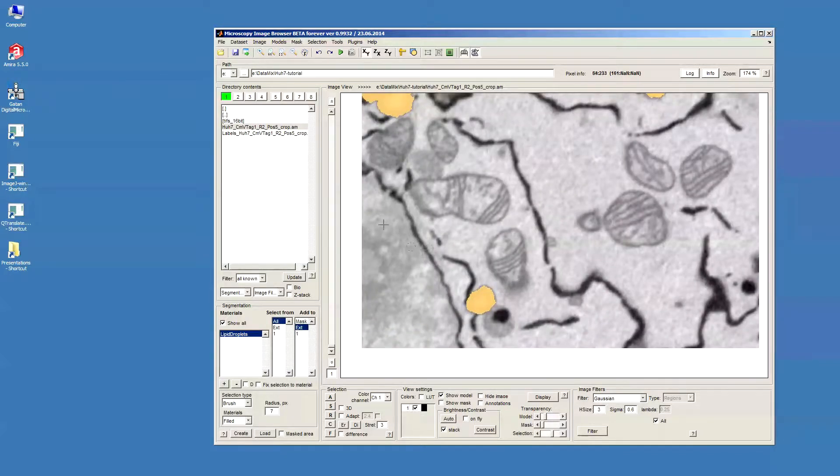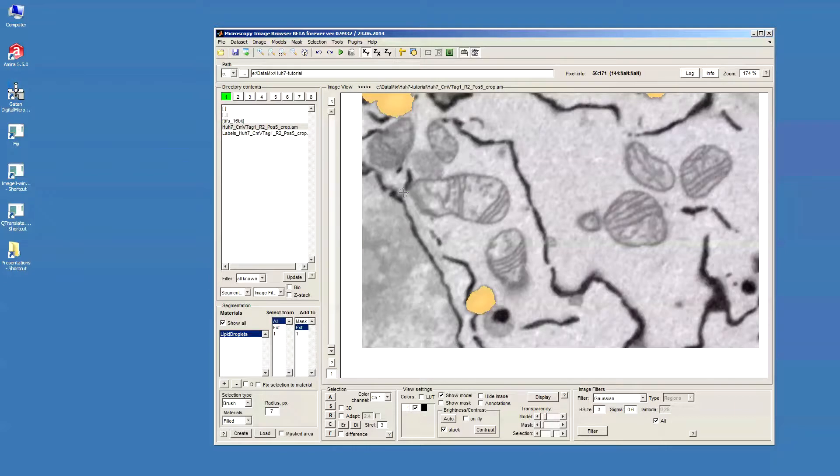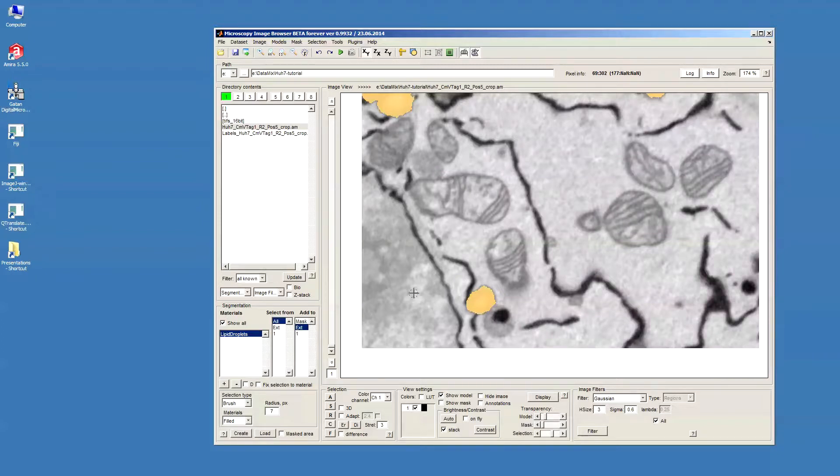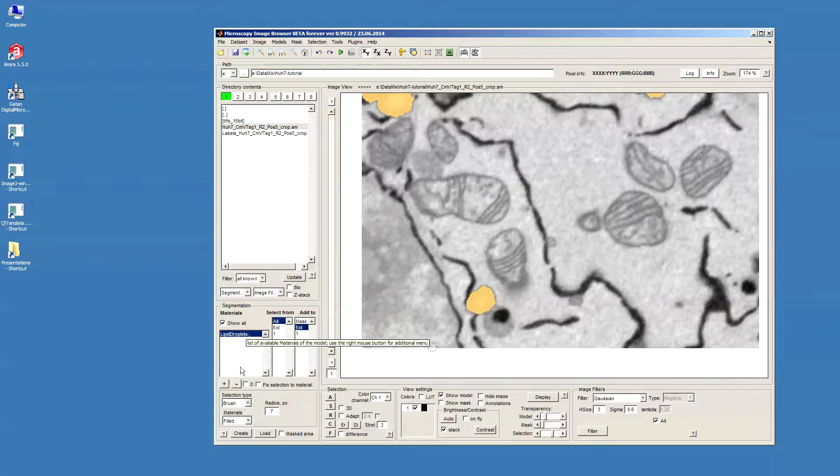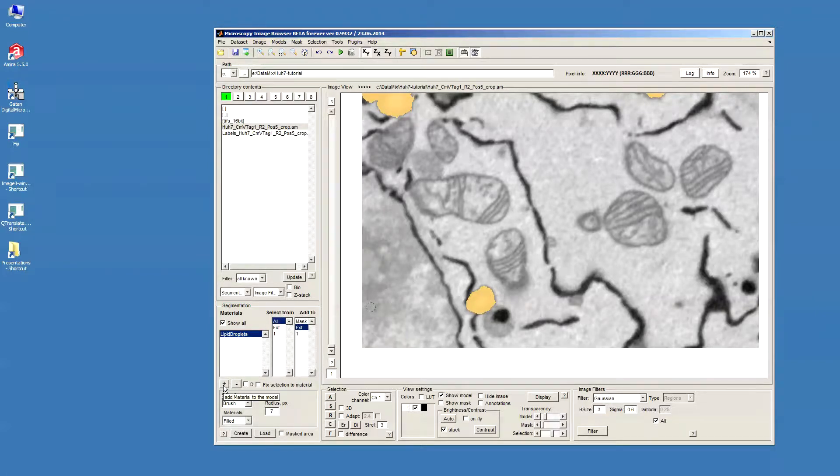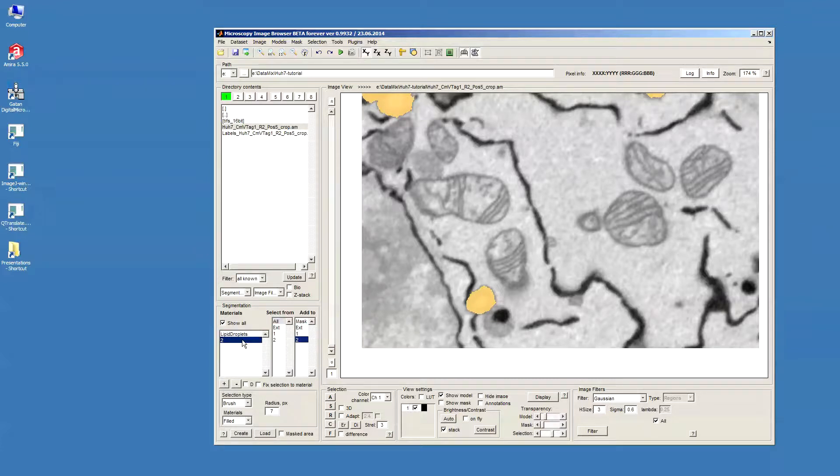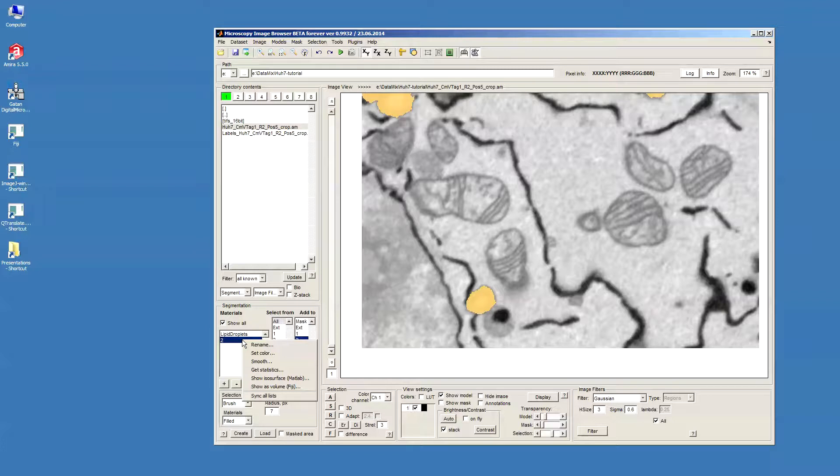Now, we will be interested in segmentation of the nuclear envelope. There are again a number of ways how it can be done, but I will show you the way using the Membrane Click Tracker tool and the line interpolation. First we start with adding additional material to the model by pressing the Plus button. Then we can name this material as Nuclear Envelope.